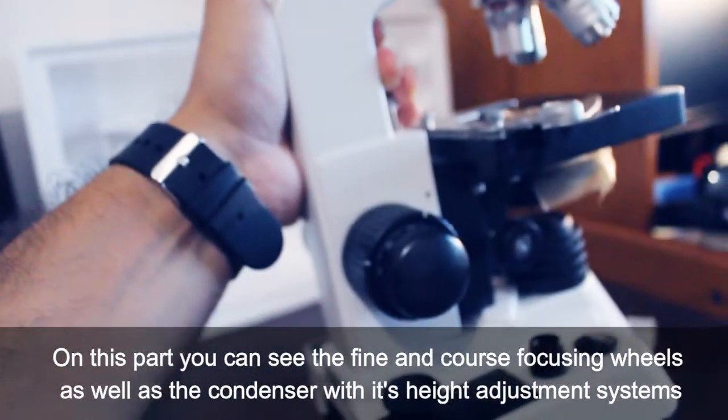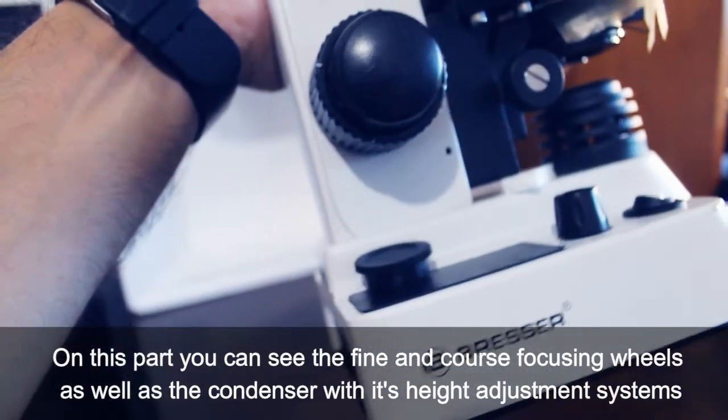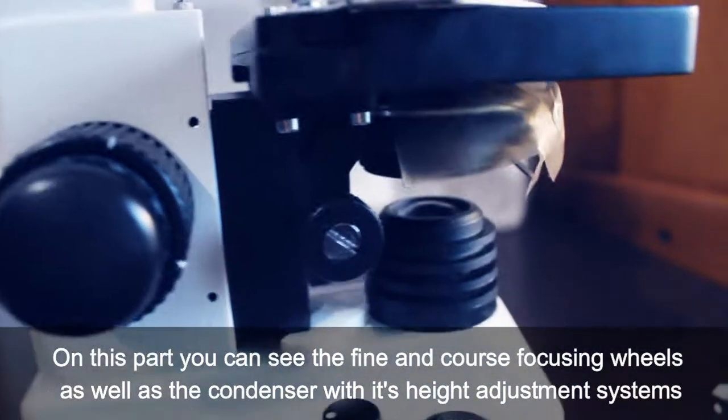On this part you can see the fine and coarse focusing wheels, as well as the condenser with its height adjustment system.